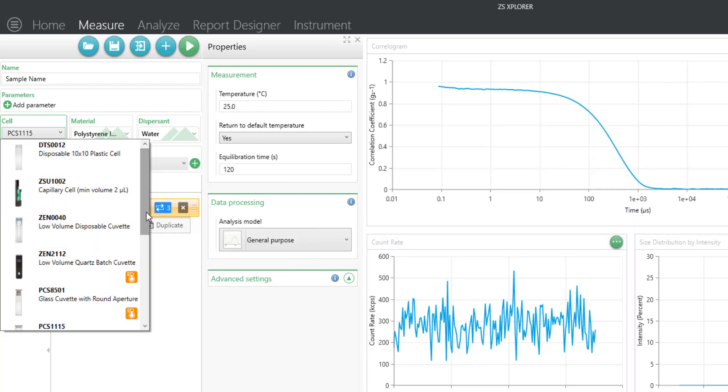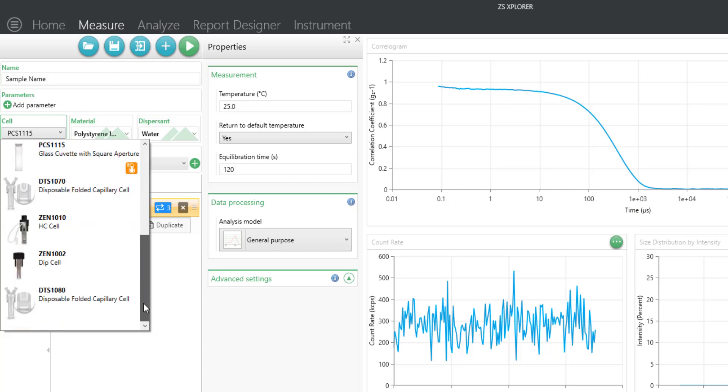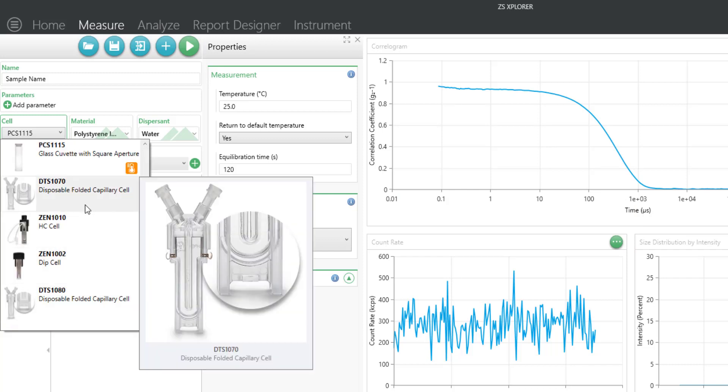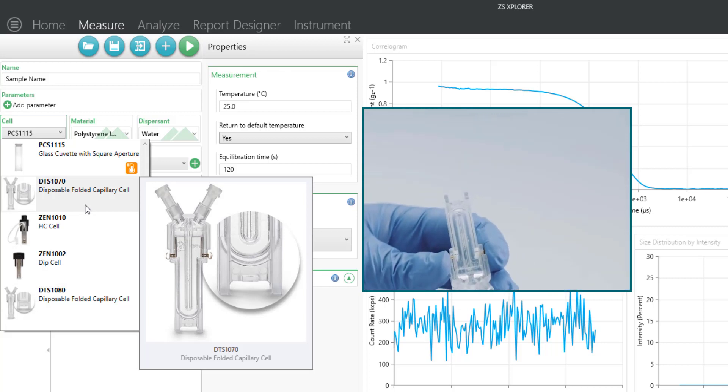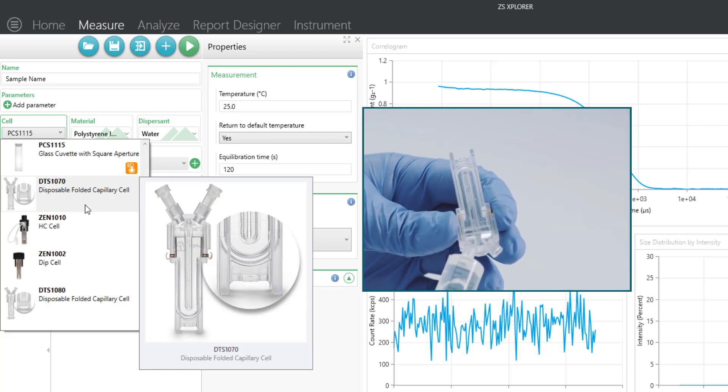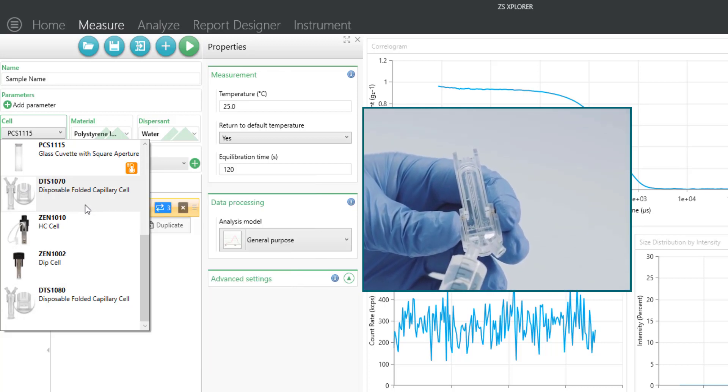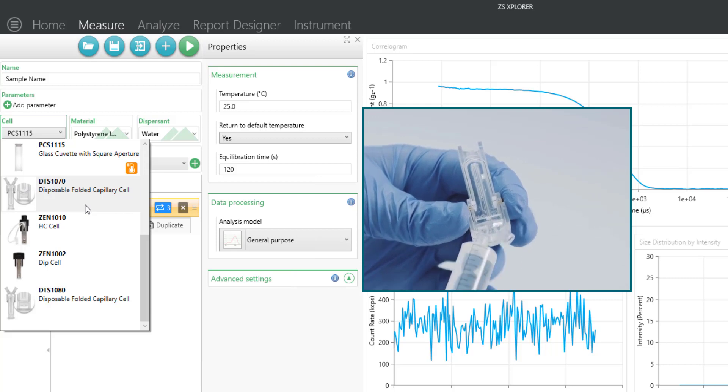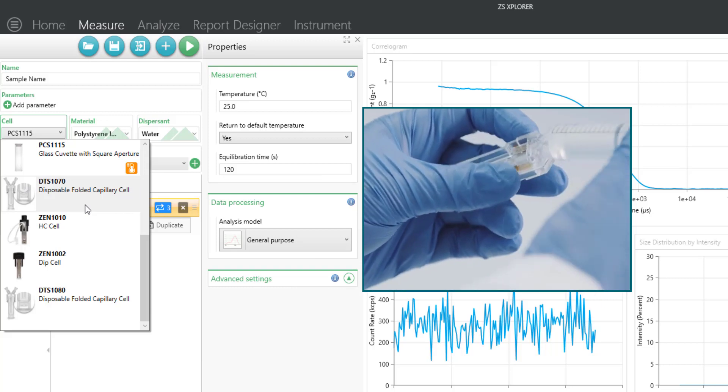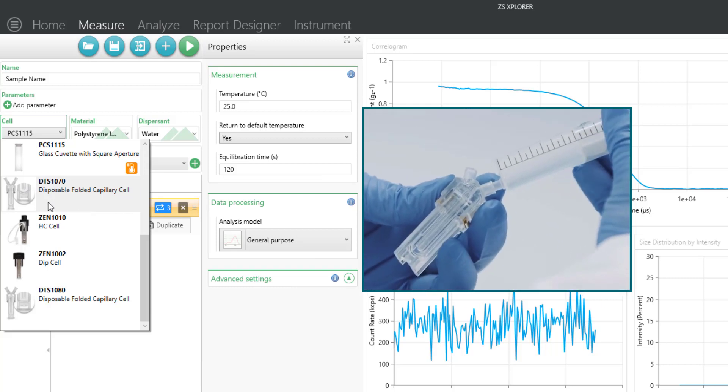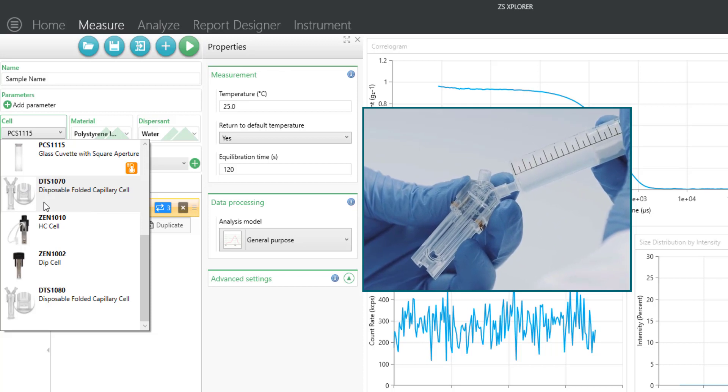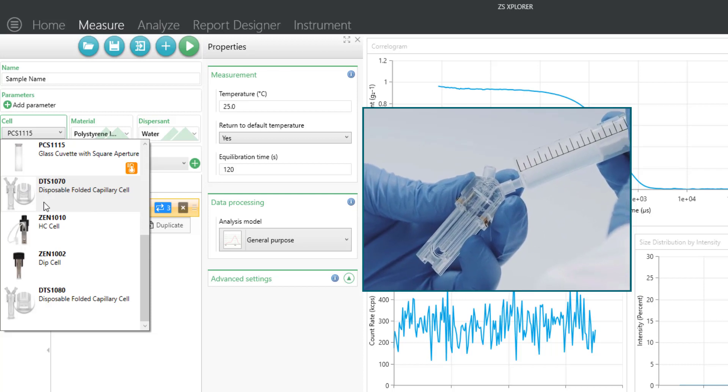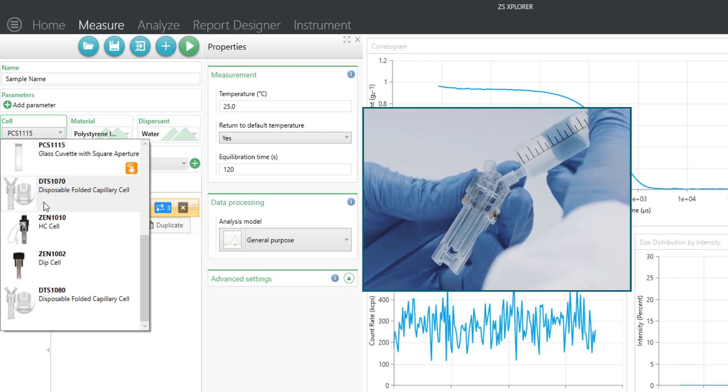The other types of cells that can be used that are disposable for sizing measurements are the folded capillary cells such as the DTS-1070. Now these are a bit more expensive than the regular disposable cells, but the advantage here is that you can do both sizing and zeta potential measurements in the same cell if you choose.